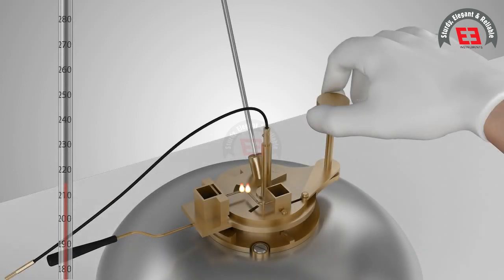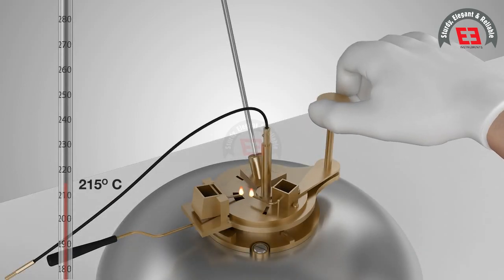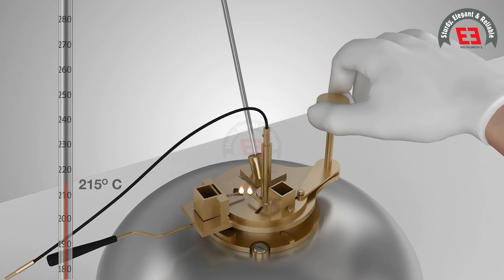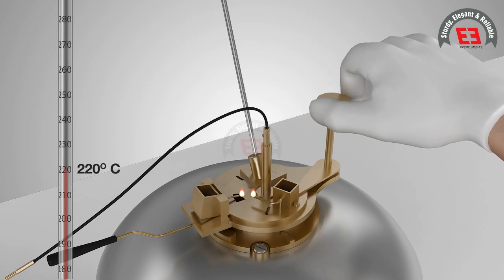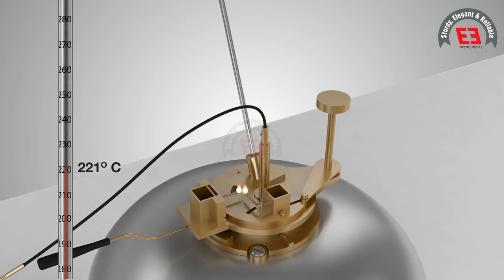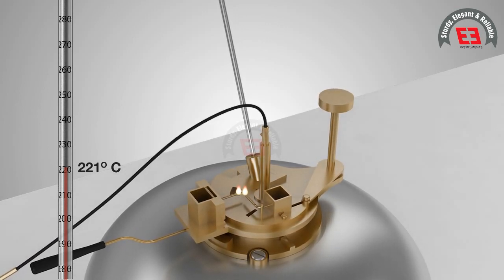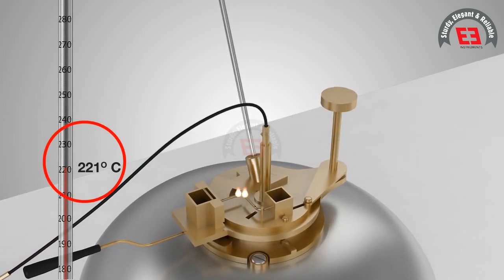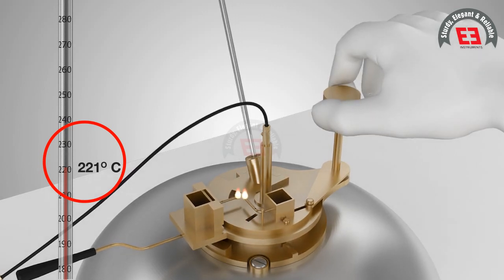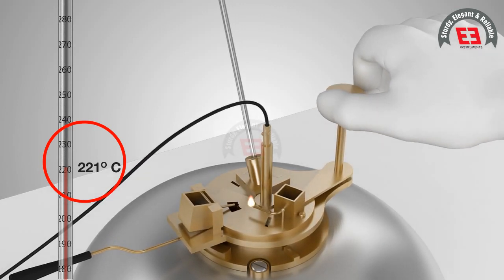Thereafter, the test flame is applied at the rise of every 1 to 3 degrees Celsius interval. The flash point is taken as the temperature read on the thermometer at the time of the flame application that causes a distinct flash in the interior of the cup.